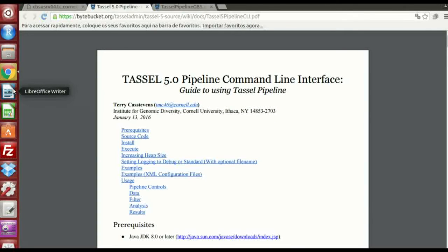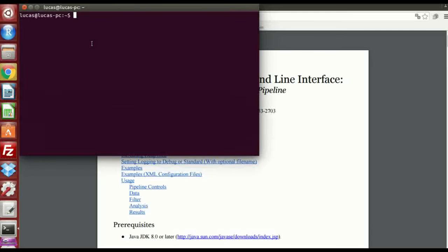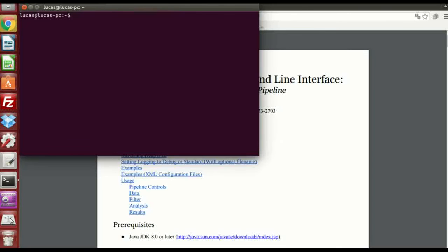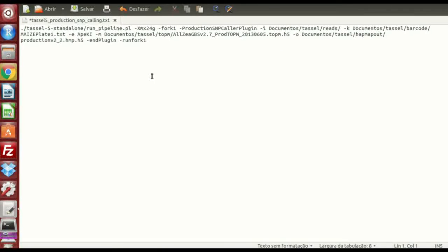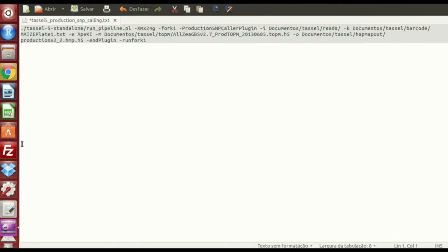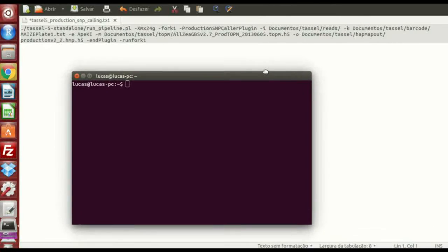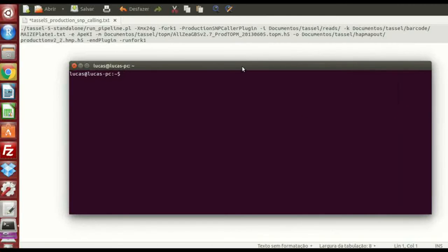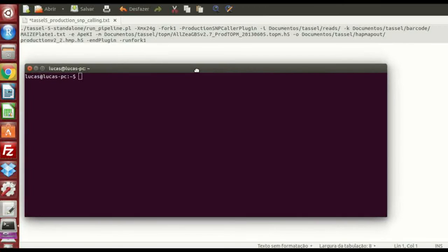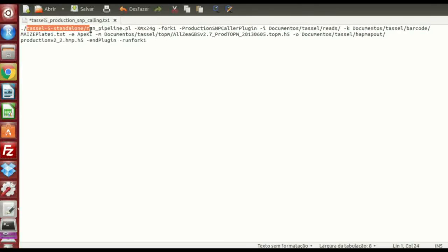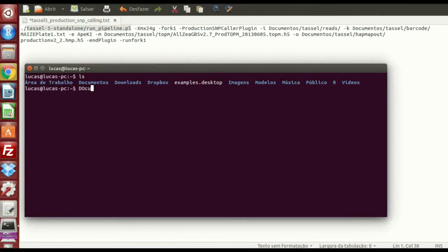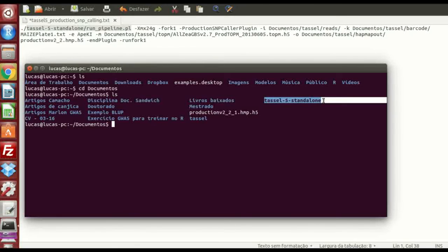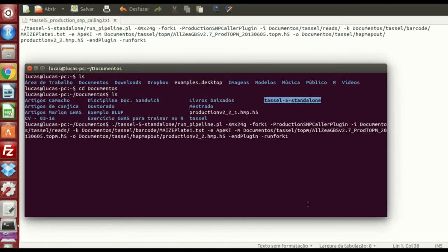Okay. Now we're going to open the terminal again. And you're going to copy and paste. Let me just see if I copy. Okay. You're going to copy this. We have to put all that information from the file here on the terminal. And first of all, you have to know where this file is in your computer. This tassel 5 standalone run pipeline. Okay? In my case, it's in documents. So I'm going to change the directory again. Here I have the... Here it is. Tassel standalone.